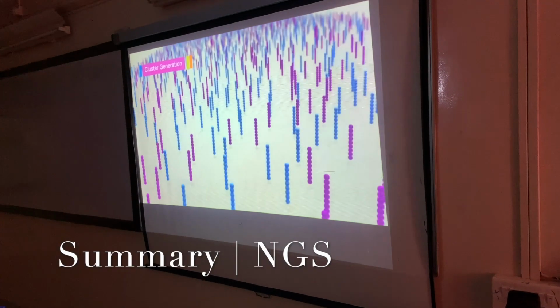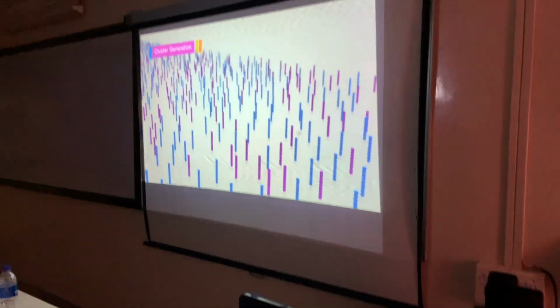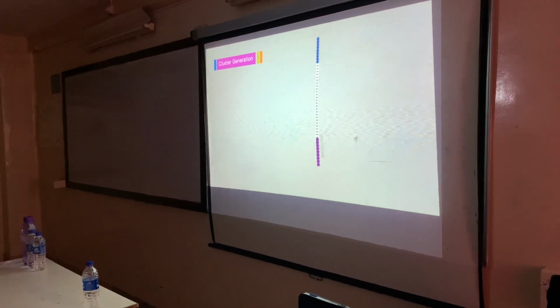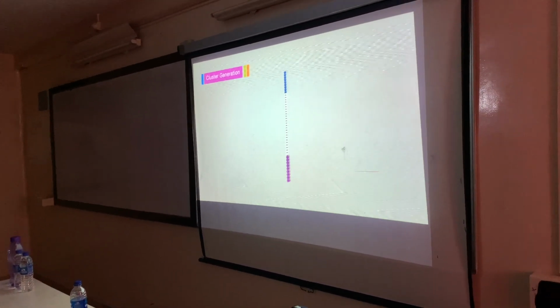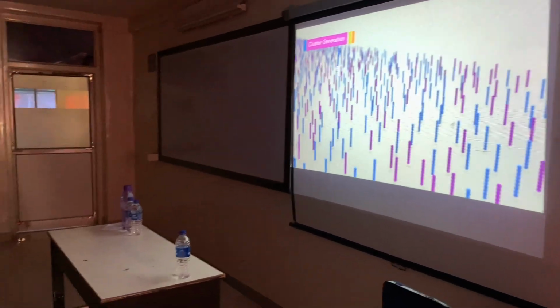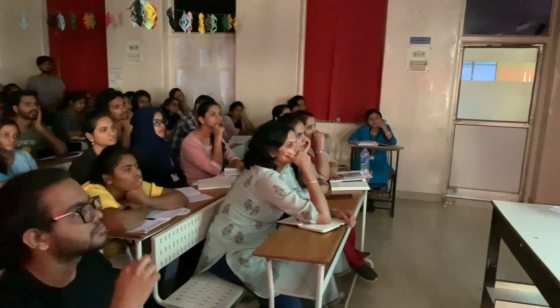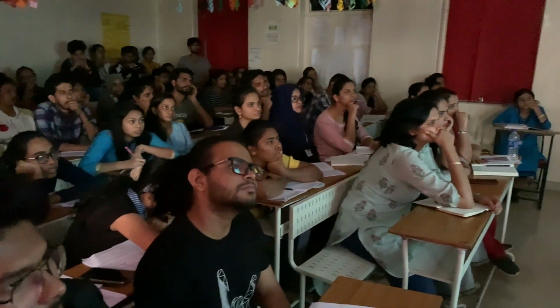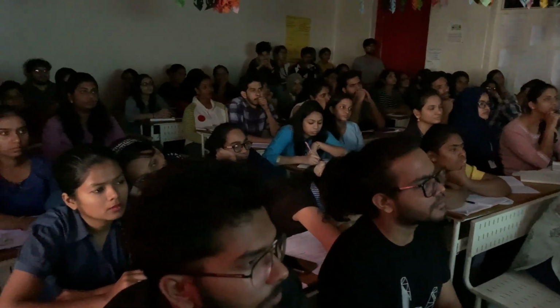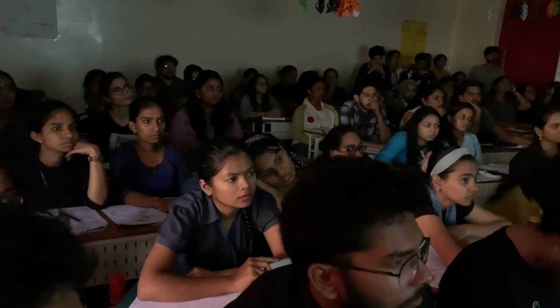a lawn, composed of two types of oligos. Hybridization is enabled by the first of the two types of oligos on the surface. This oligo is complementary to the adapter region on one of the fragment strands. A polymerase creates a complement of the hybridized fragment. The double-stranded molecule is denatured, and the original template is washed away.